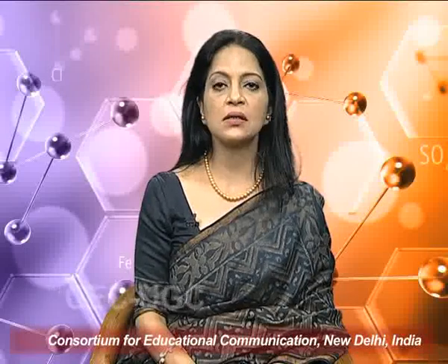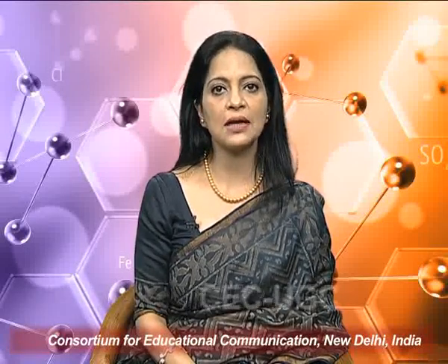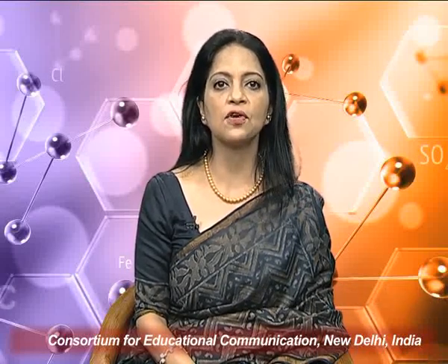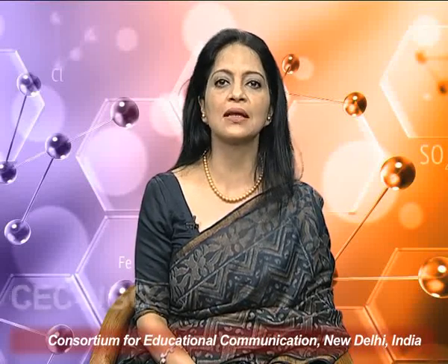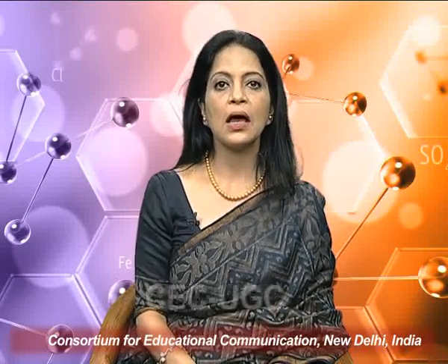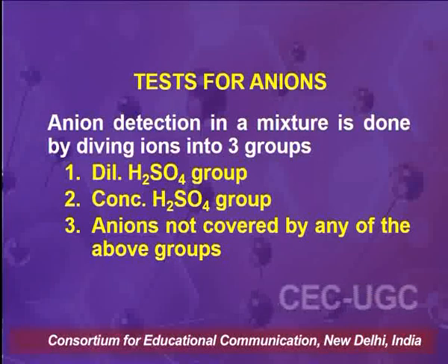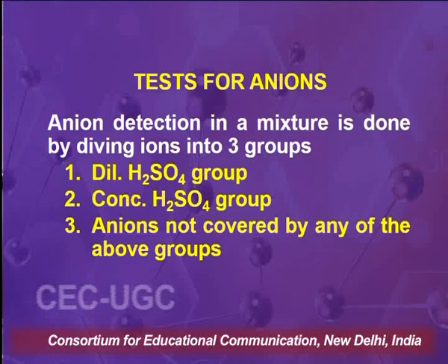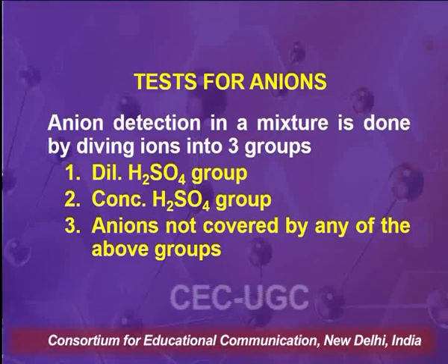Now, when we talk about the mixture analysis, there is a systematic analysis followed for the detection of a mixture containing various cations and anions. In this case, first of all, anions are detected, and then the analysis for cations continues. So the test for anions is done in a systematic manner. The anion detection in a mixture is done by dividing the anions into 3 groups.